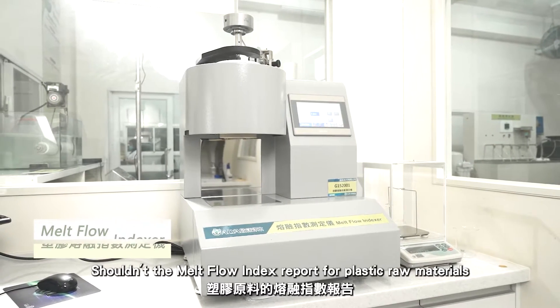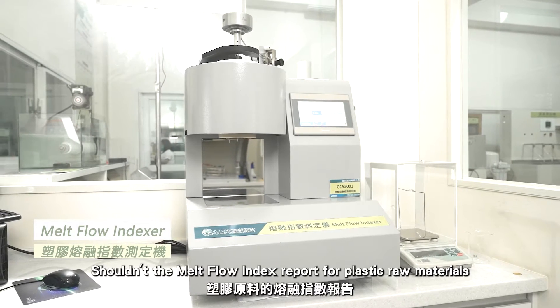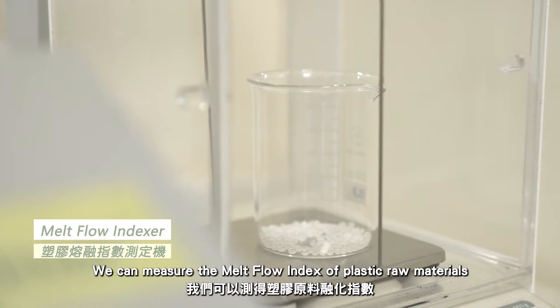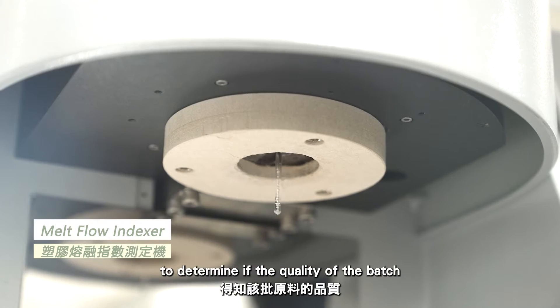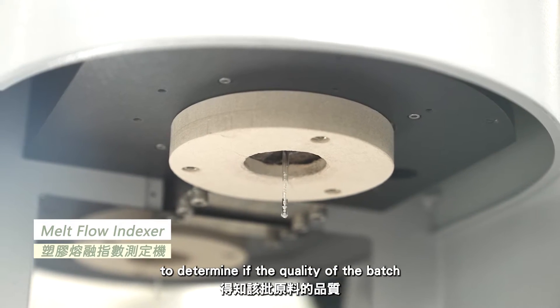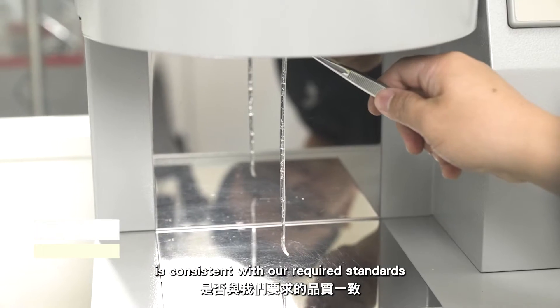Shouldn't the melt flow index for plastic raw materials be provided by the material supplier? We can measure the melt flow index of raw materials to determine if the quality of the batch is consistent with our required standards.